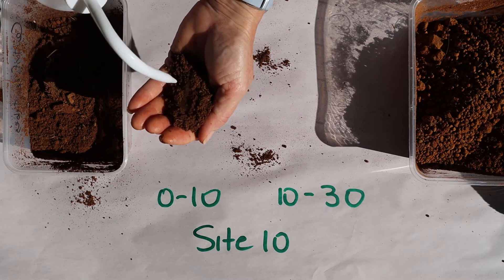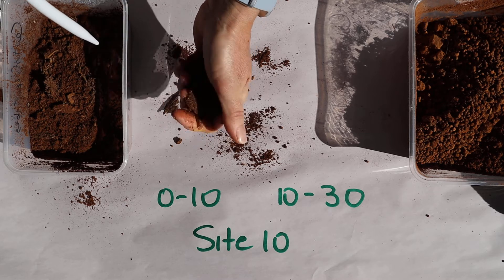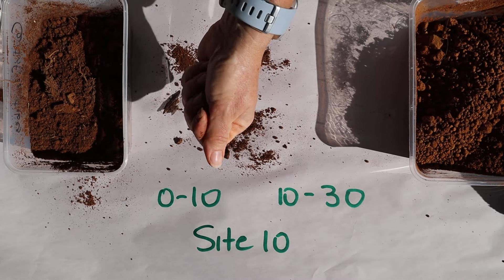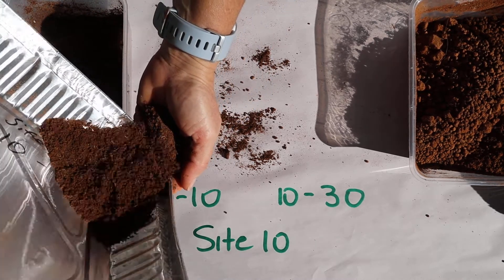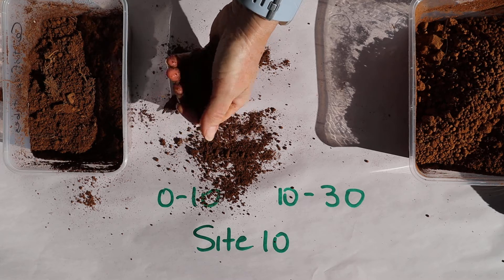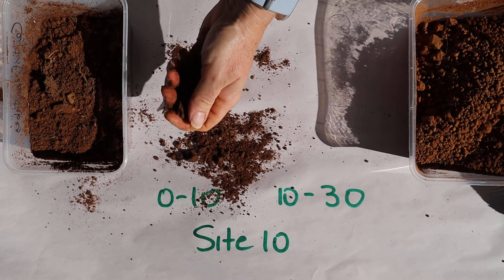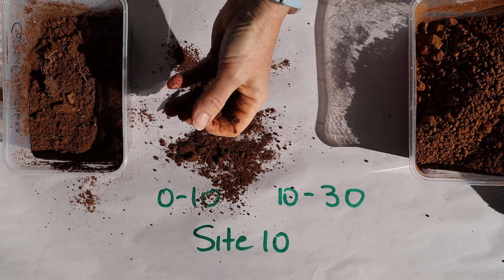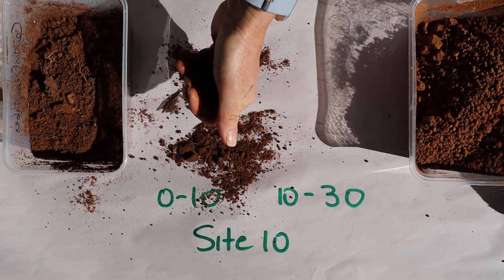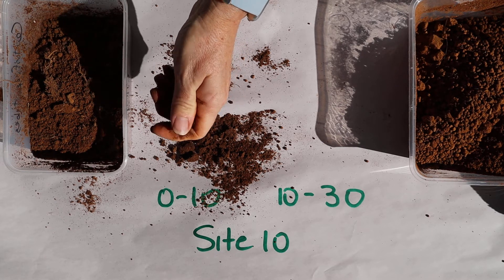Now I'm going to make a bolus from the soils to do the hand texturing. I've sieved a little bit of this soil off camera, just because there was a bit of root matter in there. And even though I've sieved it, I think it's going to be difficult to get a ribbon out of this.